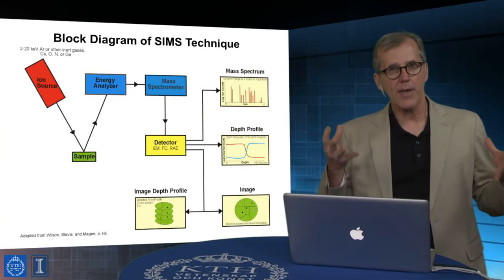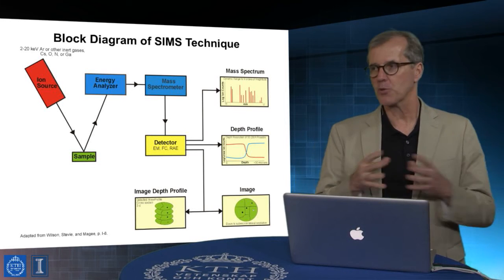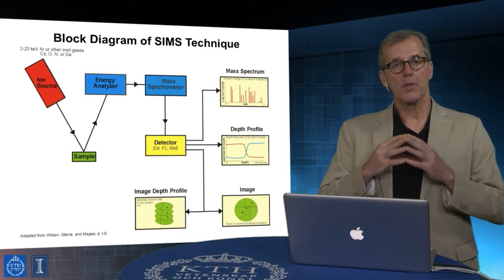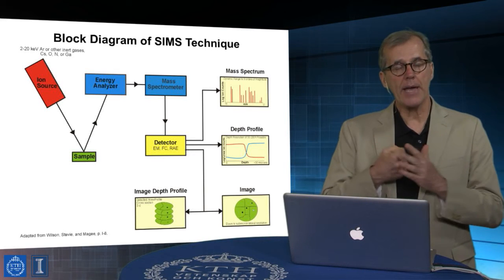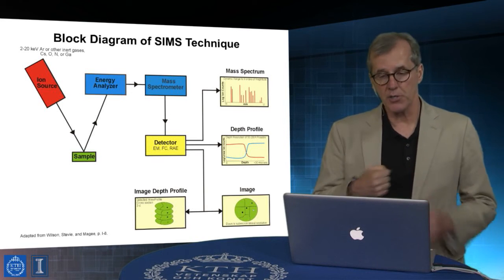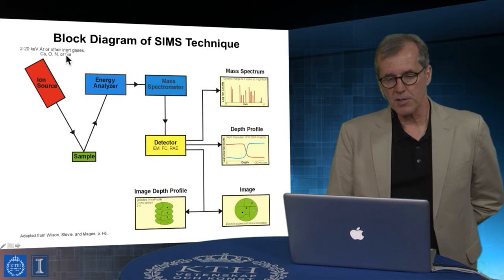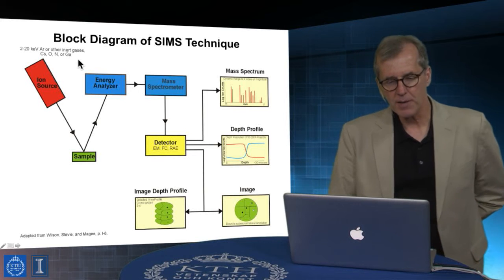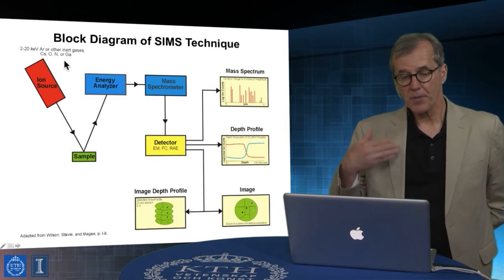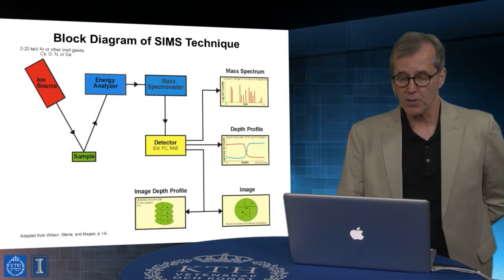The reason why you would use an ion of that type is that it's actually, using the asteroid analogy, a fairly massive asteroid, such that it's a way of impacting a solid with an ion which will deposit fairly large amounts of energy, but very proximate to the collision interface. Okay, and so that's a really interesting and important aspect of this technique. How we can vary these ions. And the other thing I should say is that the ions can, in principle, be both positive ions and negative ions, and that has important characteristics as well.